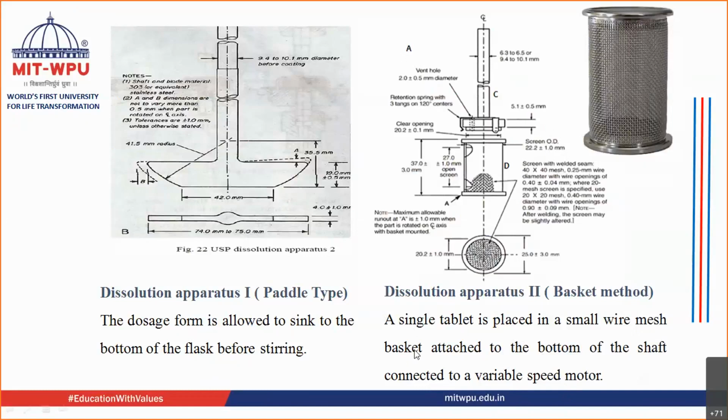What the speed motor does is rotate this shaft. The drive shaft is attached on the top to the speed motor, which rotates it at a constant speed.